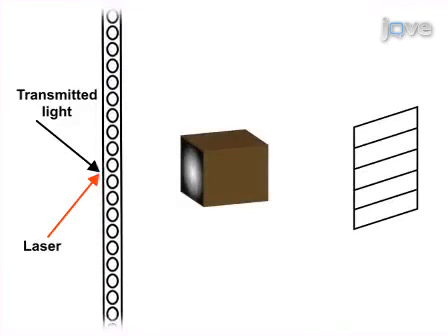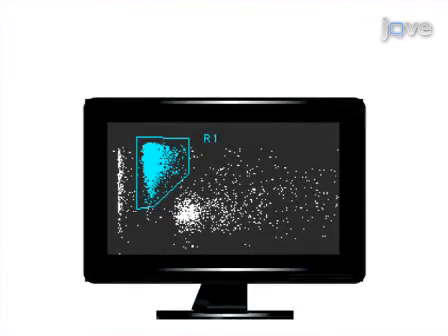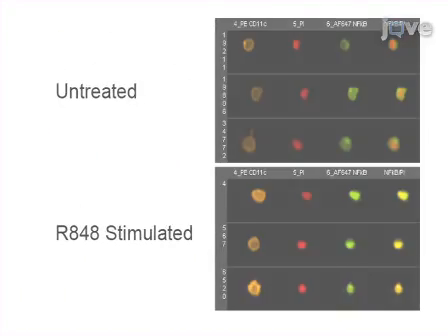Next, the cells are hydrodynamically focused, excited with laser light, and imaged on a time delay integration CCD camera. Finally, images are acquired using the image stream cytometer, and quantification of NF-kappa B translocation in each cellular image is performed using the IDEAS software. Ultimately, the differences between each subject group can be determined through analysis of dot plots, histograms, and cell images.